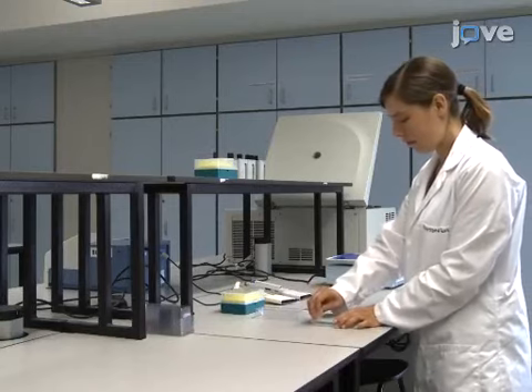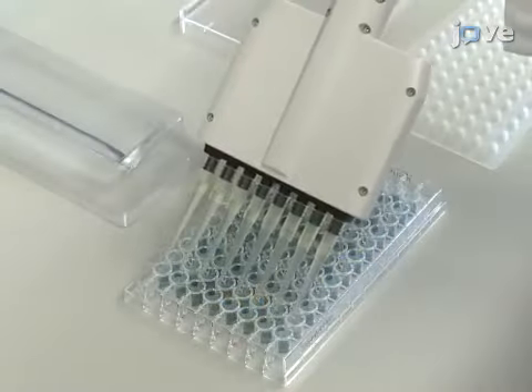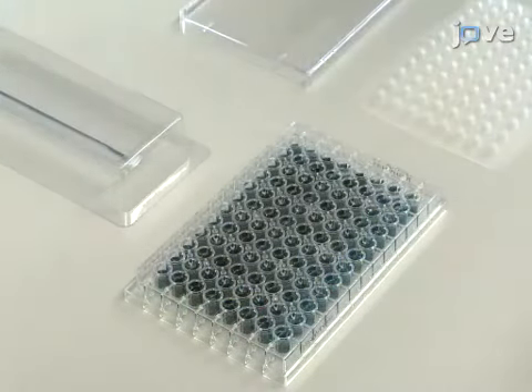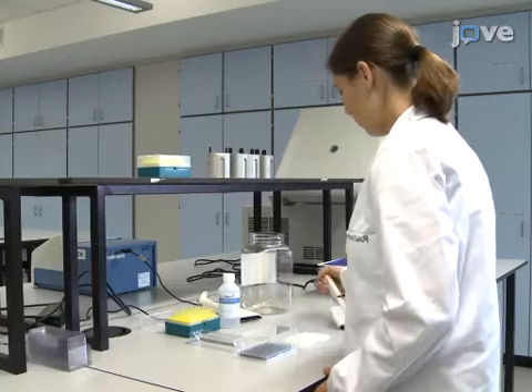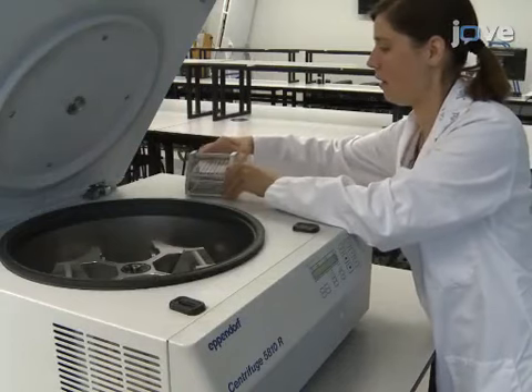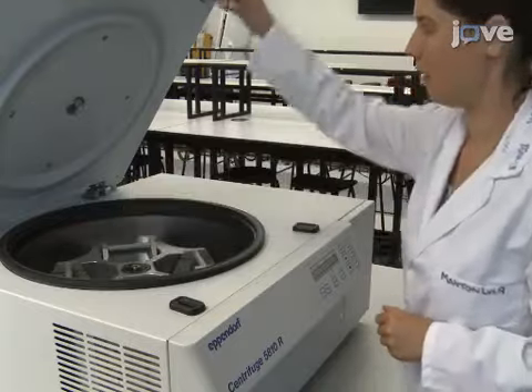To begin, activate the 96-well filter assay kit plate by adding 200 microliters of activation solution to each well. Incubate at room temperature without agitation for 10 minutes. Then use a centrifuge and any standard 96-well plate for collection to spin down the extant activation solution.